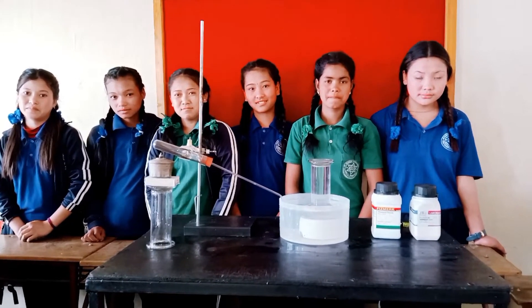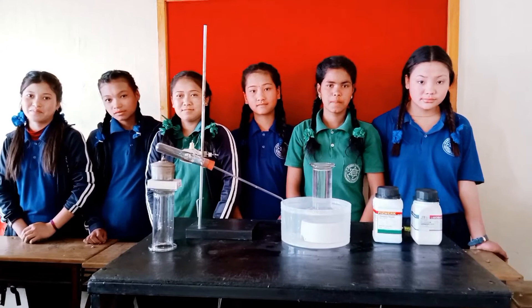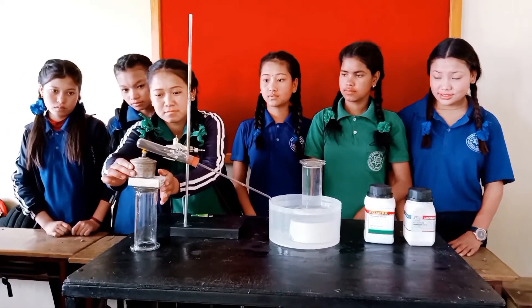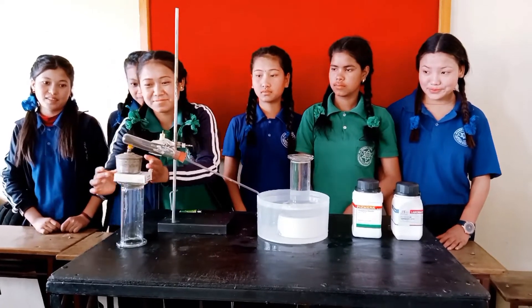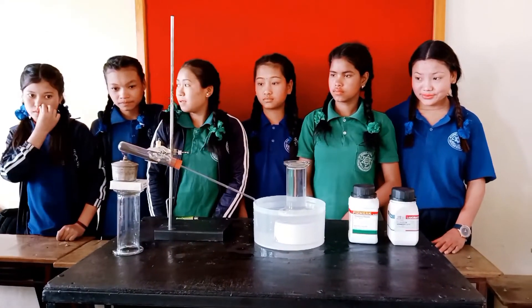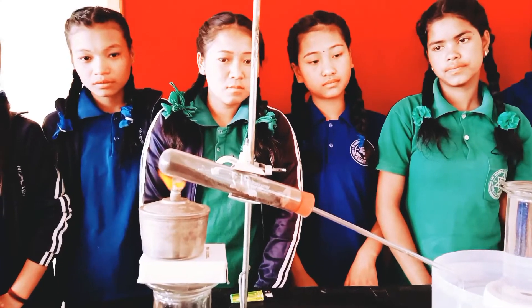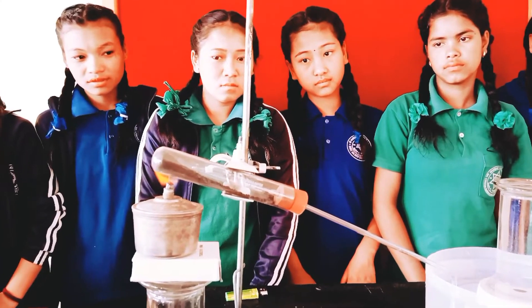For the experiment, first of all the apparatus are arranged properly by following all the precautions. When the mixture in the hot glass test tube is heated at about 250 degrees Celsius, potassium chlorate is decomposed into potassium chloride and oxygen gas.